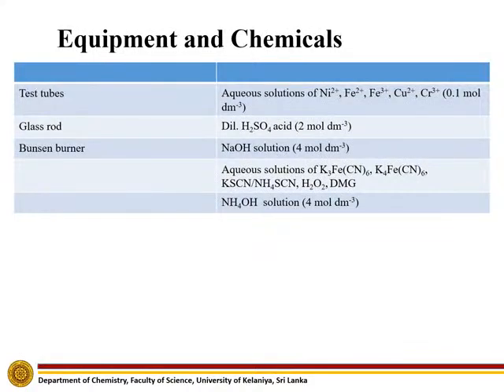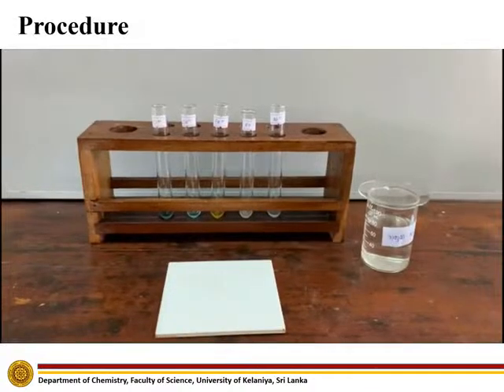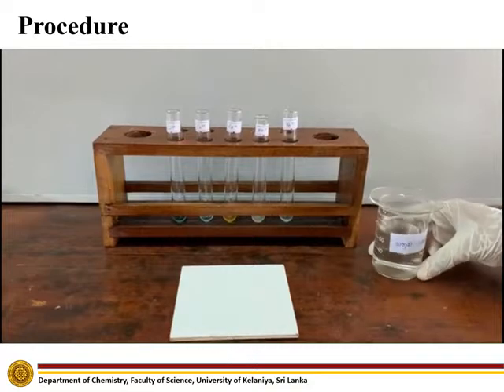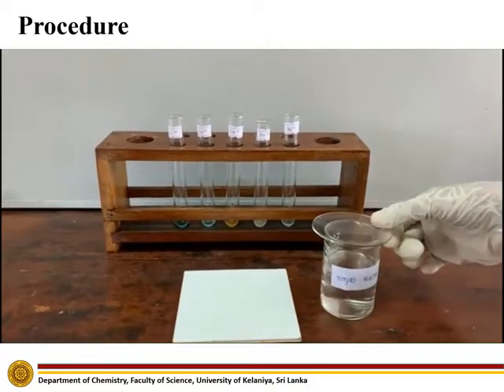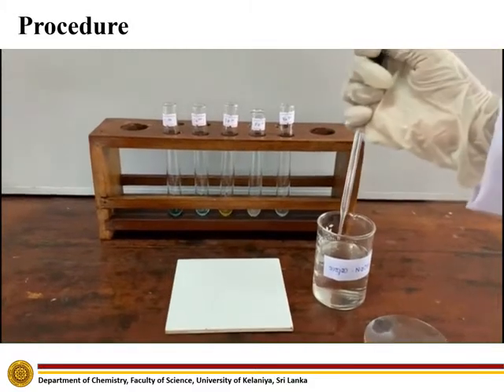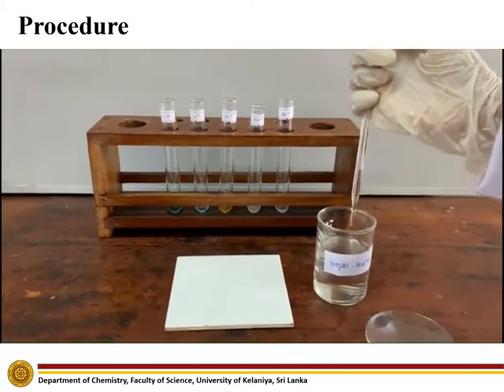Equipment and chemicals required for the experiment. Procedure: add diluted sodium hydroxide to the given cation solutions.